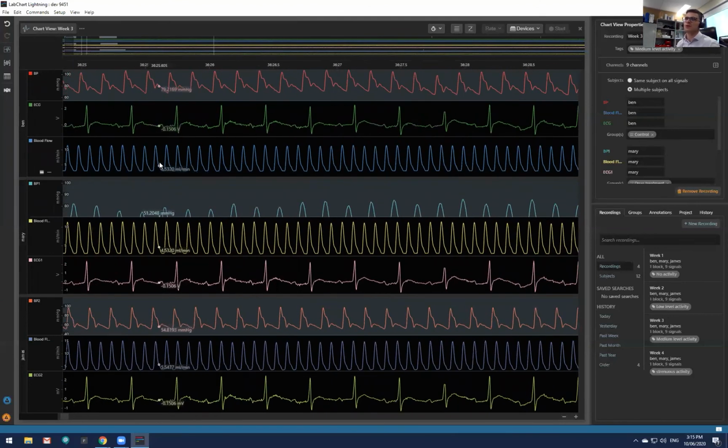So the next webinar we'll be doing will be in a fortnight, and that will be on me recording some data. So I'll do some 2-point calibrations, measuring some pulse transducers, something simple like that, and going through how that works. And we can do some signal conditioning, some filtering of our signal, and talk a bit more about annotations, like drop-in comments as well. We'll do that for our next webinar.